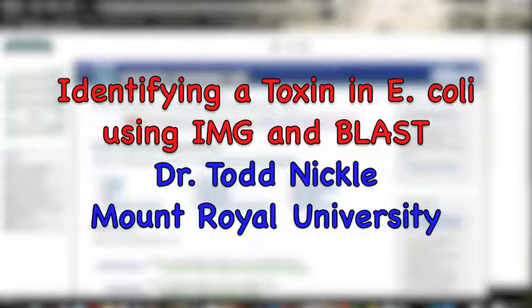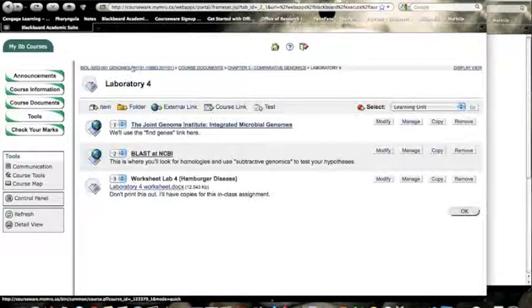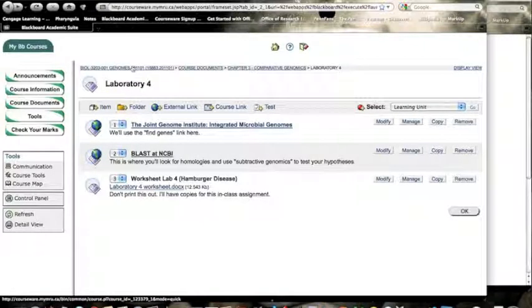So here's a quick video demonstrating how I would go about finding the toxin gene for that strain of E. coli that causes hamburger disease. That's E. coli O157:H7.